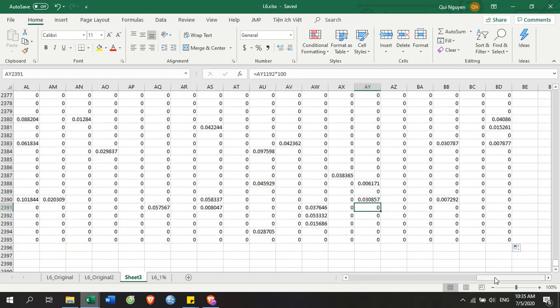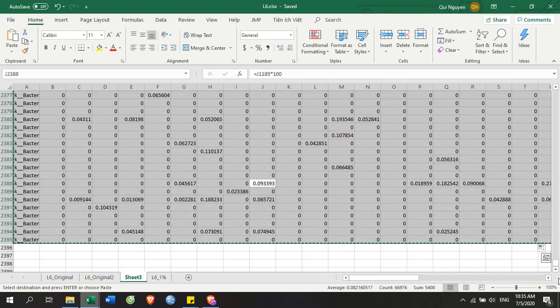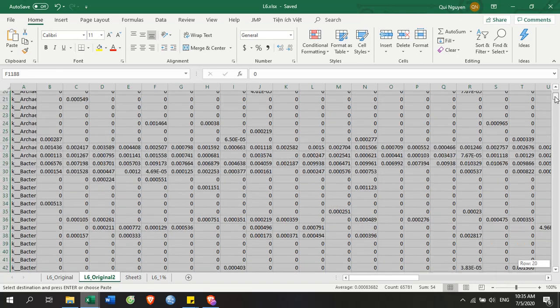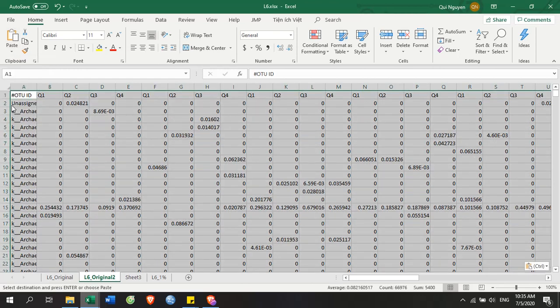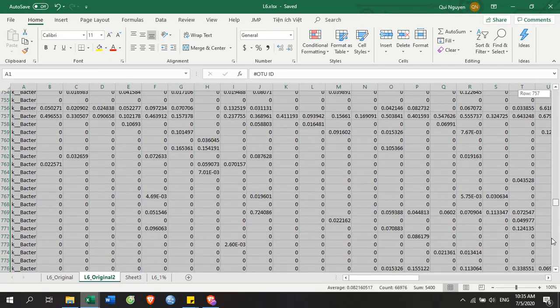And then what I do now is copy this and paste here. To paste here, we will use paste values; if we don't use this, it will also copy the formula. So I'll only paste the figure, so you can see. Okay, it's okay.